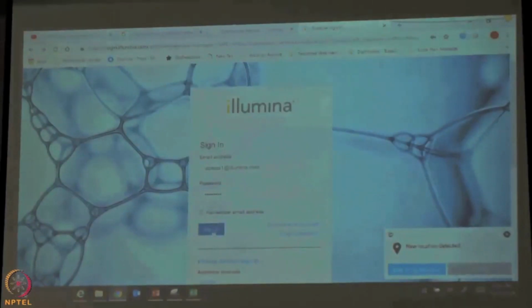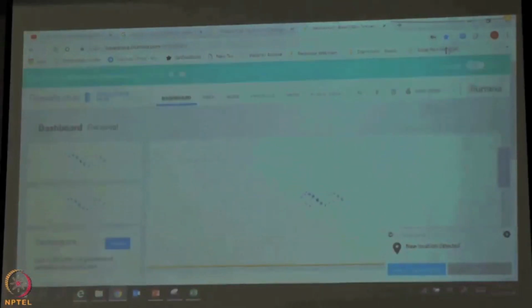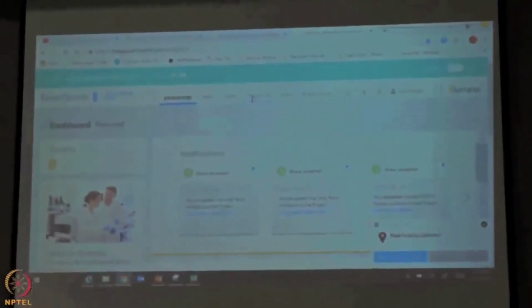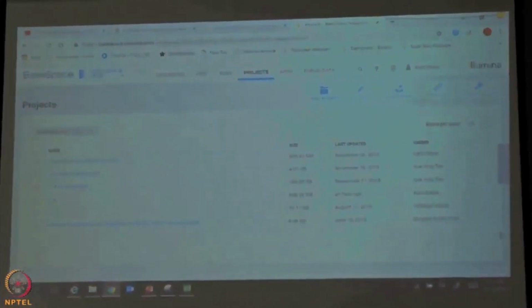Okay, what I want you guys to do is log into your BaseSpace account and refer to the handout that was given to you. But before we actually start doing the hands-on session according to the handout, I wanted to show one very interesting property of the Illumina data. That is something that Mukesh again touched upon during his presentation. That is the quality score, the very high quality data that is generated on the Illumina platform.